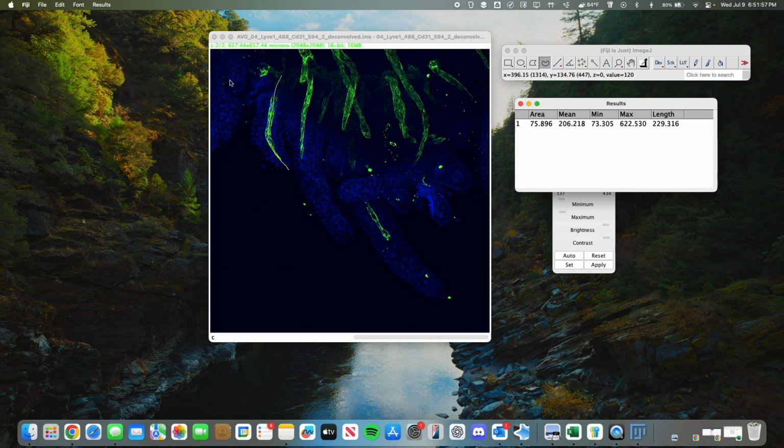All right, so we have our first measurement of the total base to tip of villus length, and in all of our cases, we're trying to find that ratio, right? The maximum ratio that we have is 1. If you're getting a ratio when you go through Excel sheets that is greater than 1, that means you made a mistake, as a lacteal is protruding out of the villus, is what that would theoretically state, but we know that's not true, unless you do see that clearly on the imaging. But in our case, we don't.